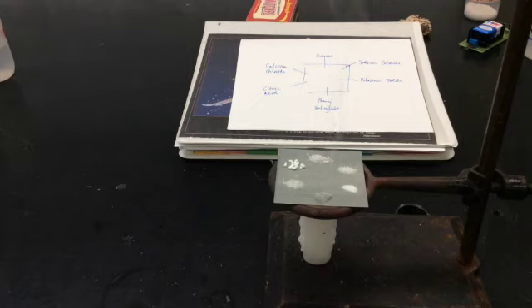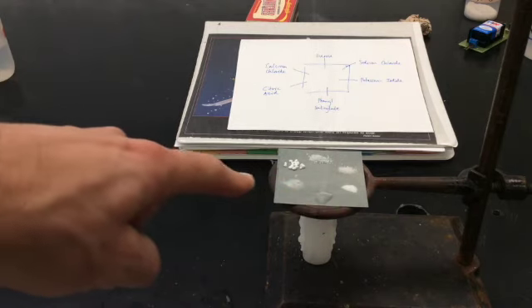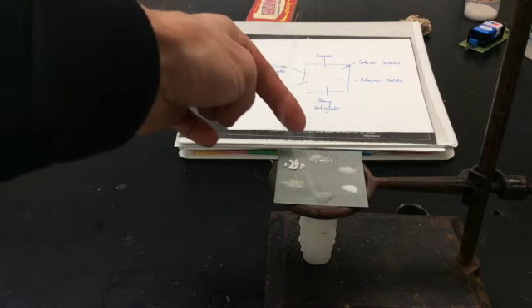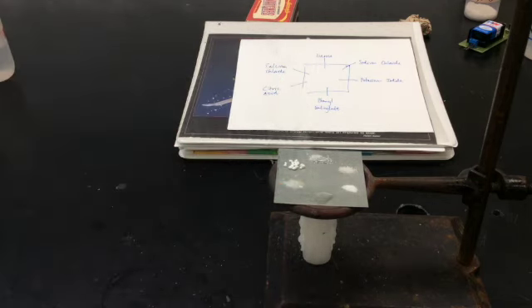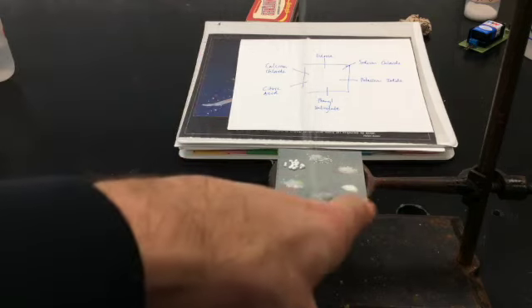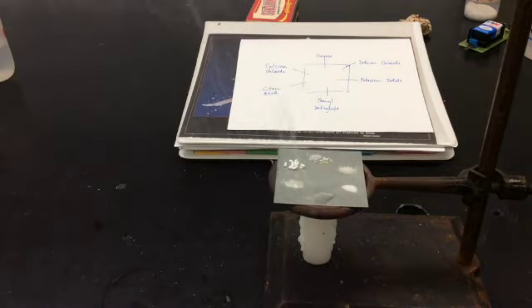And so again, just to review, phenyl salicylate was the first compound to melt, then the citric acid, and third, the sucrose. And we haven't seen anything out of the calcium chloride or the potassium iodide or the sodium chloride yet. We'll give it another little bit here before we shut everything down, just to see if something happens.